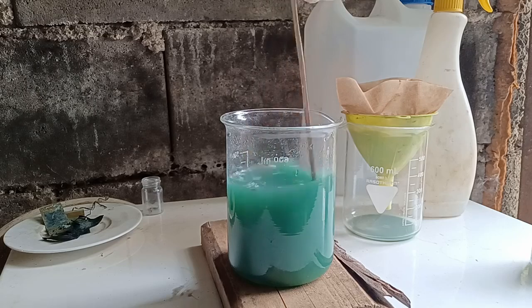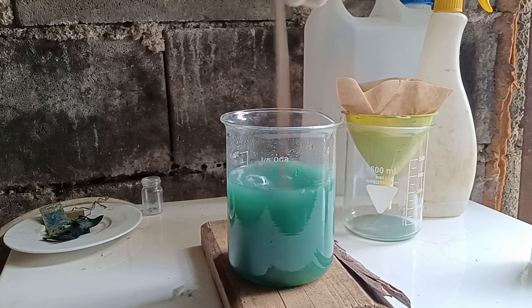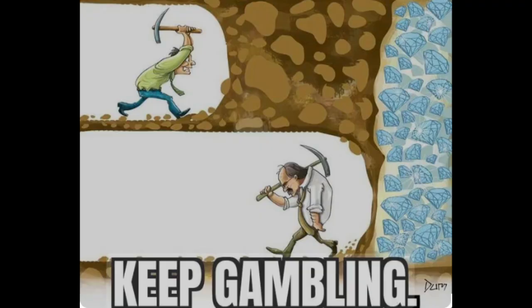I was tempted to call it quits, but I had a hunch that I maybe didn't use enough acid to dissolve all of the material, and that the silver cemented on undissolved copper. So I tried again.